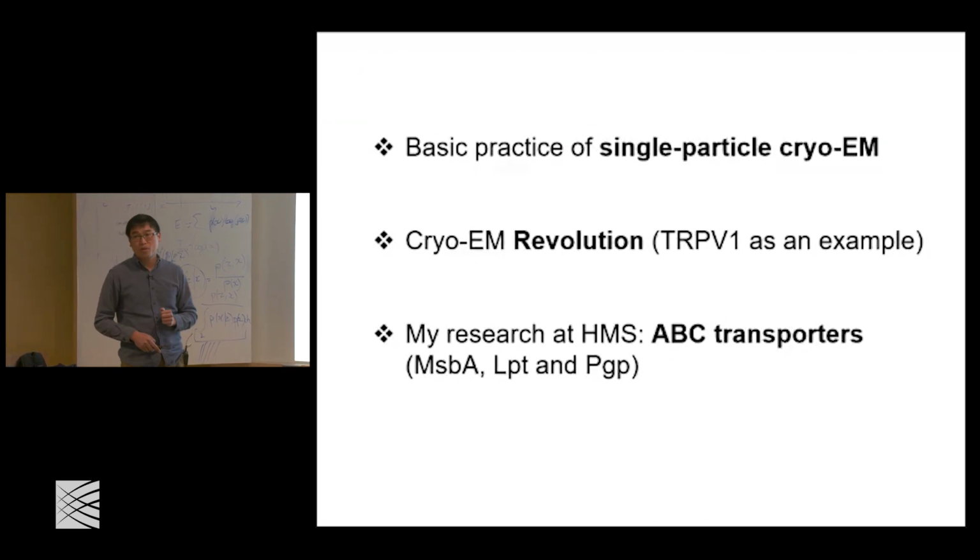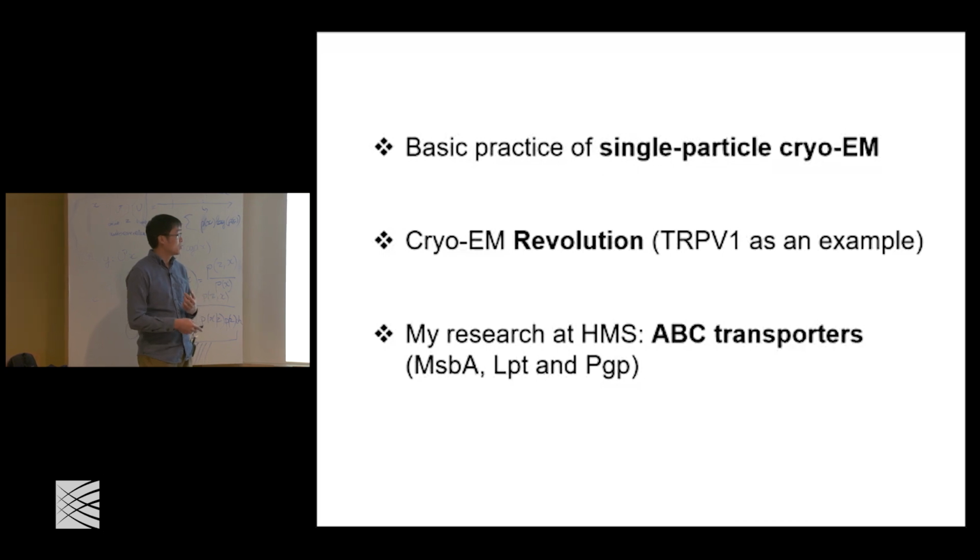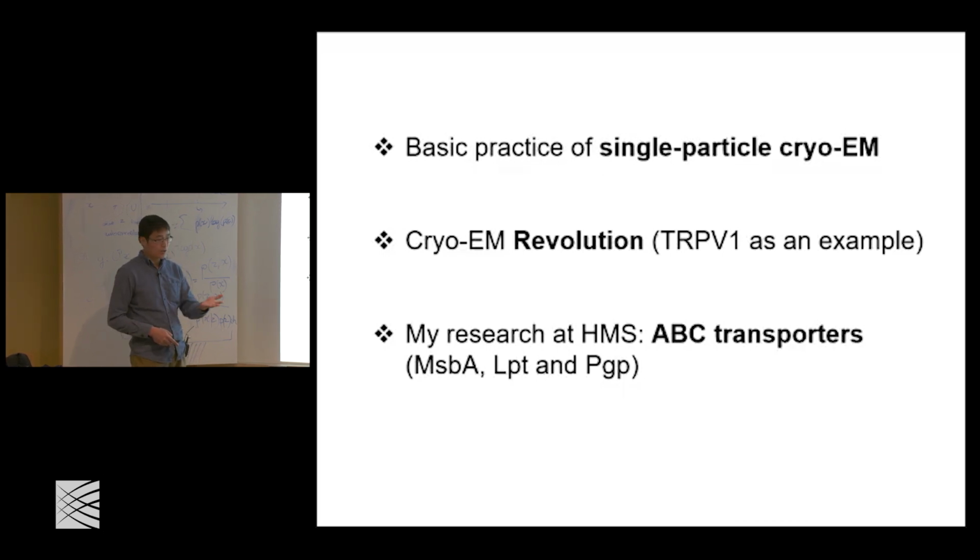So today my talk will be in three parts. One is the basic practice, exactly how we do single-particle cryo-EM, what the difficulties are, and where we can further improve it. Then I will talk about two factors which really brought in the cryo-EM revolution, and I will use the project I was involved in, TRPV1, as an example, to show how a structural study of an ion channel can benefit from that. And then I will go through three projects we are actively working on right now.